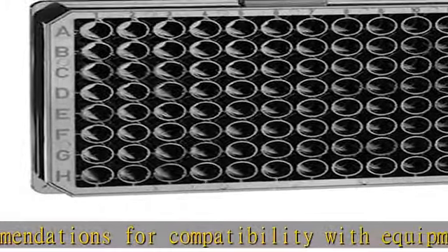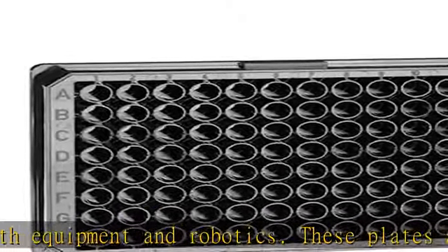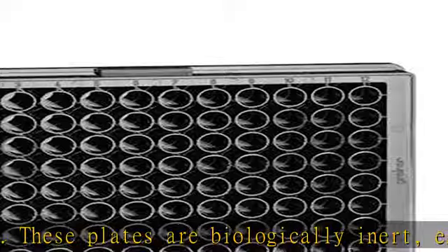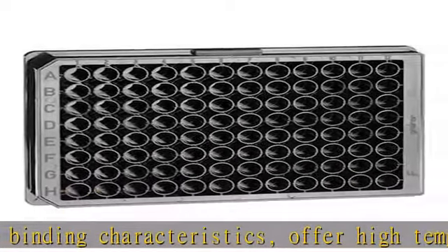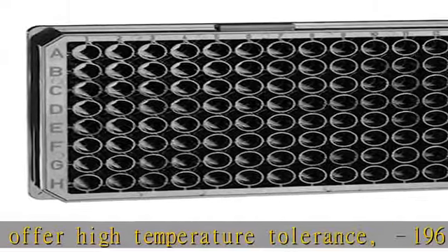Black plates are ideal for fluorescence polarization. Microplates feature alphanumerically coded wells with round, conical, or flat bottoms. Chimney well plates feature a chimney-like arrangement in which each well stands on its own to reduce the possibility of cross-contamination, and feature individual rims that rise above the surface of the plate to aid in sealing by cap mat, thermal sealer, or adhesive sealer.